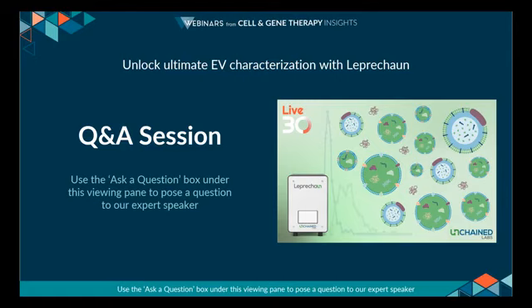Each marker is spotted in triplicate on the Luni surface, which means that you can capture up to 12,000 particles per capture marker. If you can have a maximum of 6 different capture markers on a Luni, that means you can look at around 72,000 particles per sample.